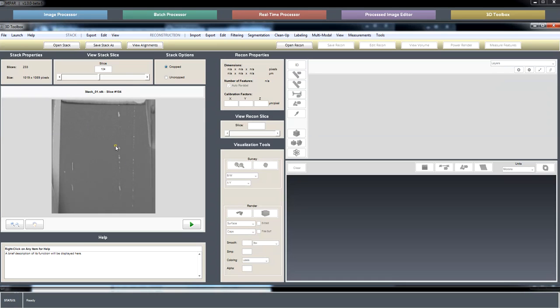So you still end up with this gradual translation up in the field of view of your area of interest. So you could do a couple of things. You could crop the stack right now just to that area, and then once it's cropped, align the stack. The trouble there is that you're then only using your features for their own alignment, and if you have a bunch of random features, that can work.